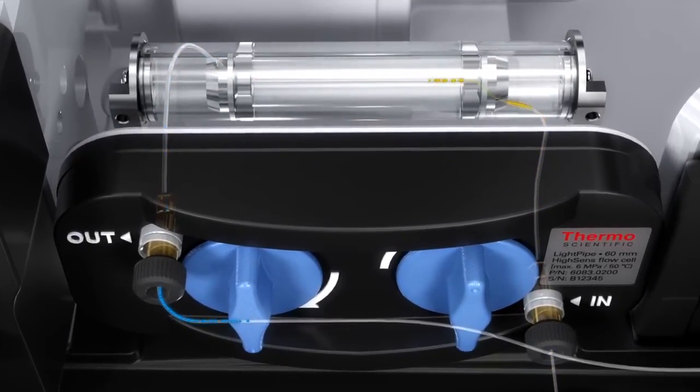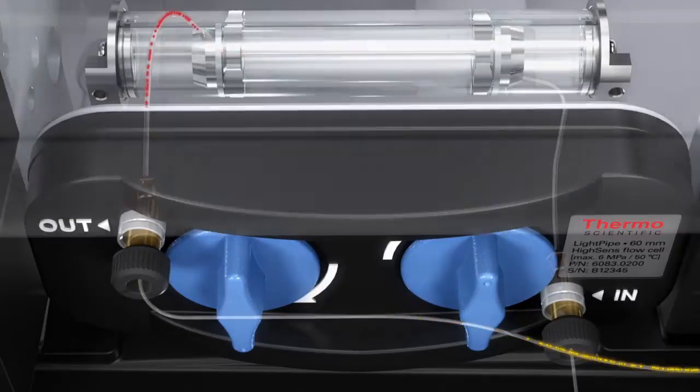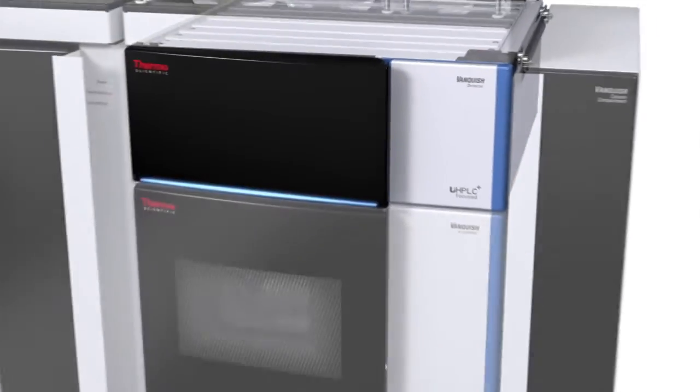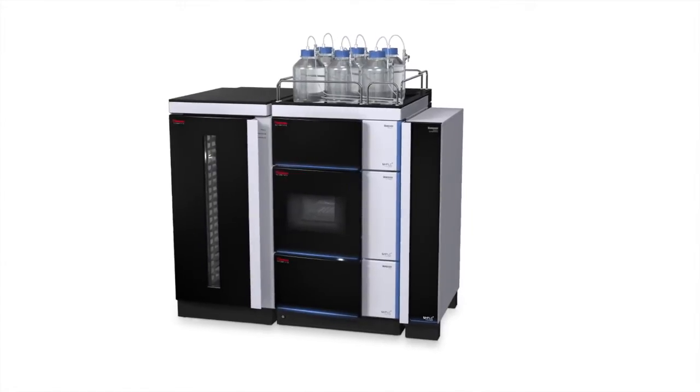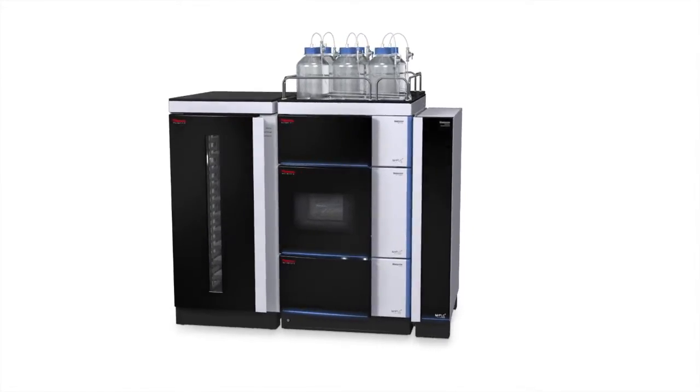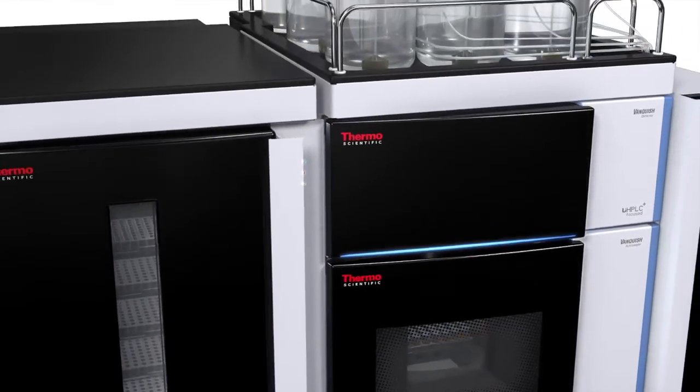The Vanquish system was designed to be an integrated system that addresses the needs of chromatographers performing state-of-the-art UHPLC. It appears as one instrument, but still offers the flexibility required by chromatographers in a clean, elegant design. Now you can perform separations like never before, improving specs on all fronts.